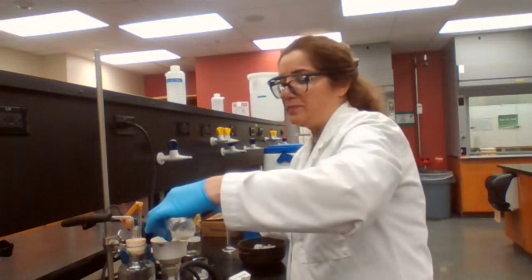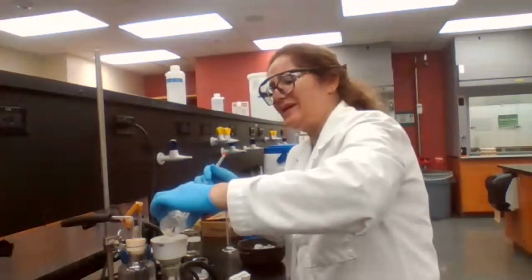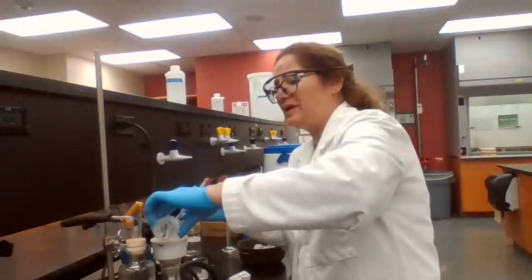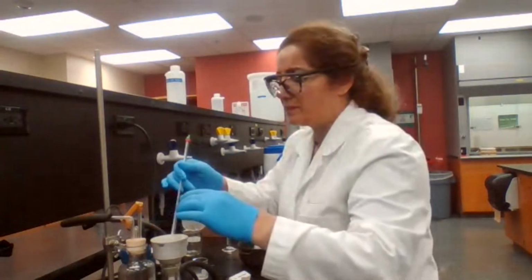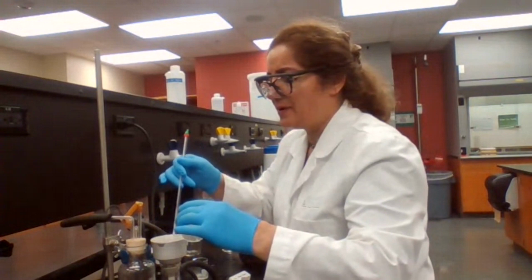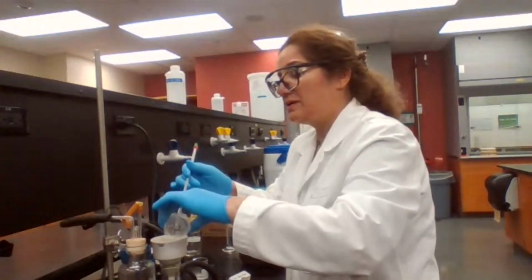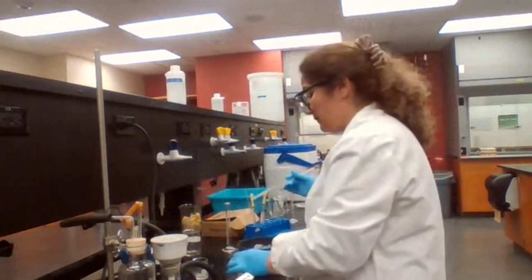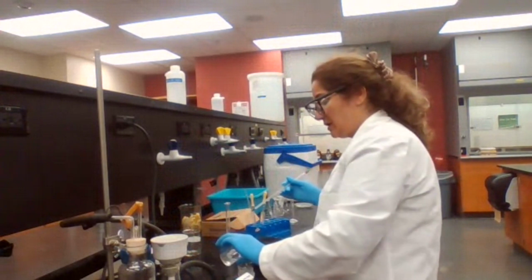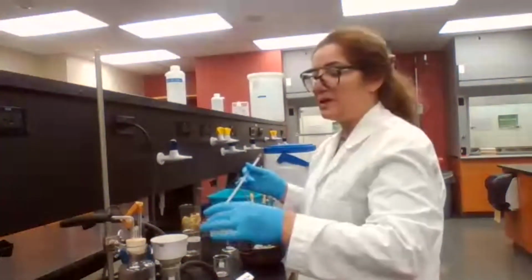We don't have a lot of product, and that's understood because this is basically a micro scale experiment. We only start with 0.4 gram, or 0.4 milliliter, of methyl benzoate. So I don't expect to get a lot of product. Considering the 0.4 milliliter, we have enough product for the reaction.